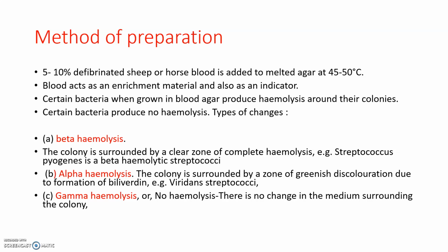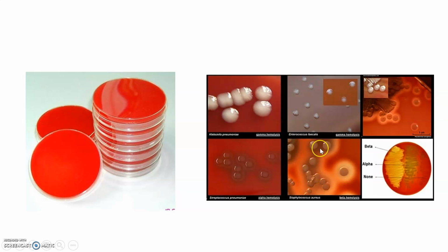So we have seen the picture here. This is the bacterial microorganism which lies in the surrounding media. So what happens? With the help of the production of hemolysin, they lyse most of the blood content within the agar. We are seeing the lysis here like this, here also, and here, etc. Here a very small lysis is there.